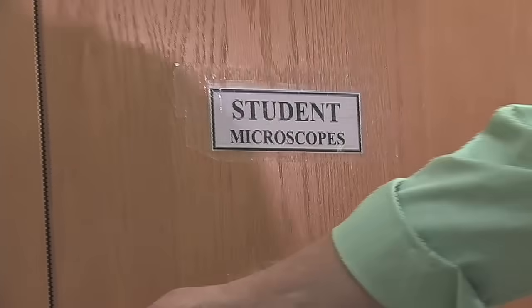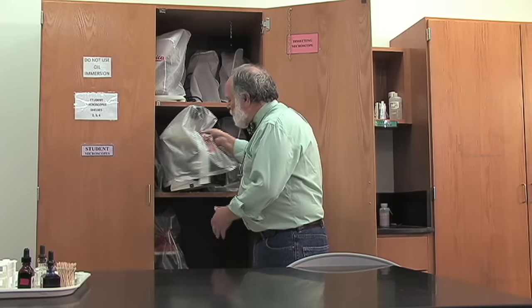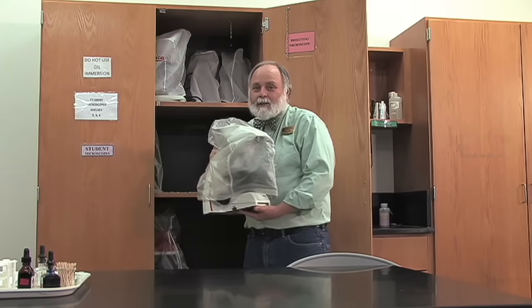When you need a microscope for a lab, they're stored in this cabinet. Grab the microscope by the handle on the arm and support it with your other hand under the base. Hold it close to your body and take it to your table.